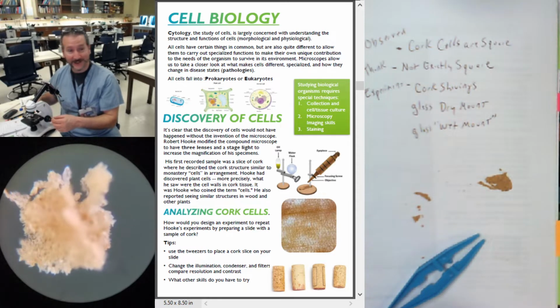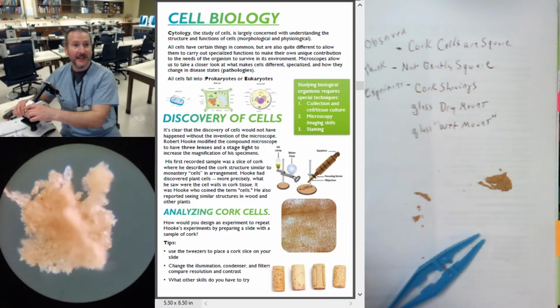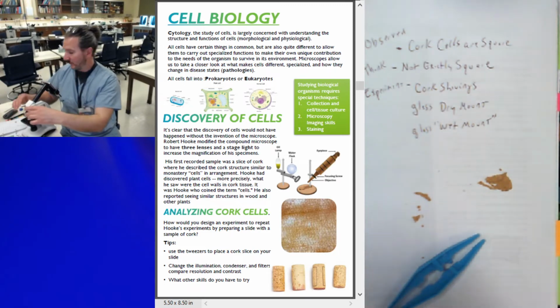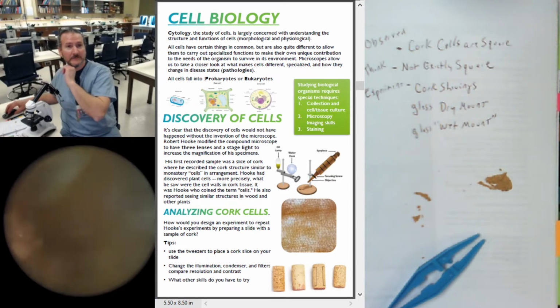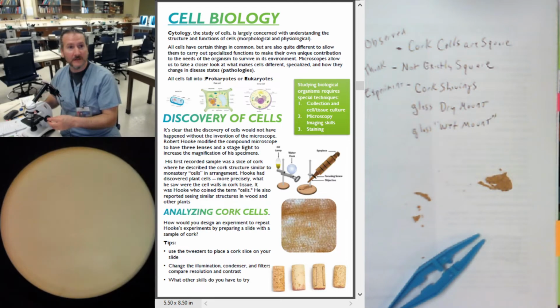I have autofocus on my phone, which was a bad idea. I'm going to flip this one more, and I probably will lose it because it's hard to use the overhead light, the long objective, and my phone didn't like it already, so let's see what I can do. Here we go. Yeah, it's going to be really hard to do.